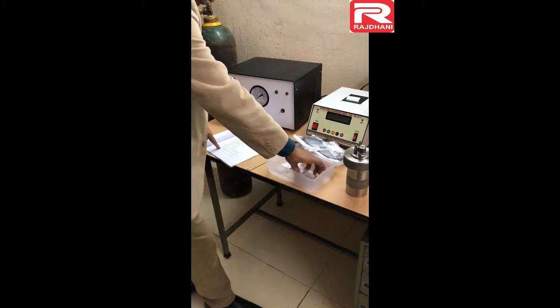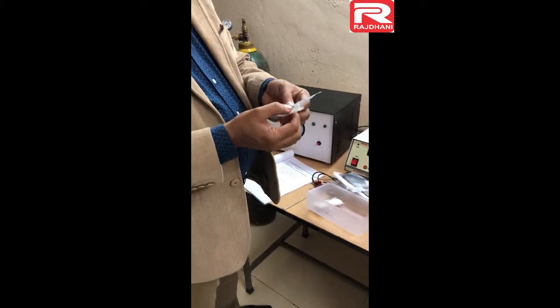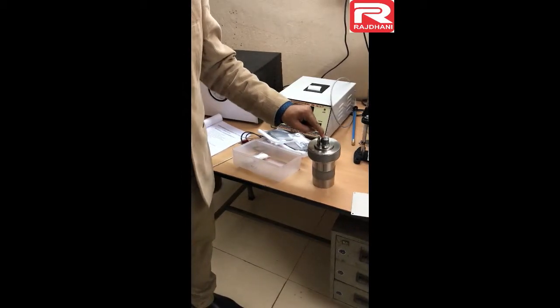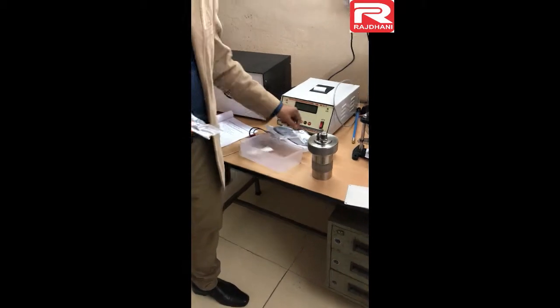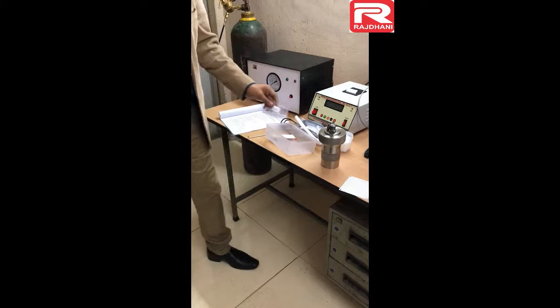The last part is the valve key — it is a plus-sign type valve key. This valve key is used to replace the valve; if there is any problem with the valve you may replace it. Five valve numbers are given as spares along with this valve key. So these are the parts description of the bomb calorimeter.